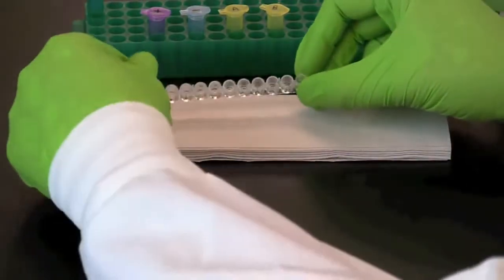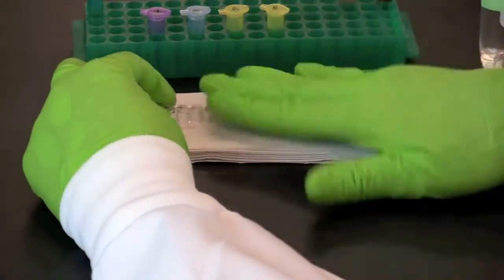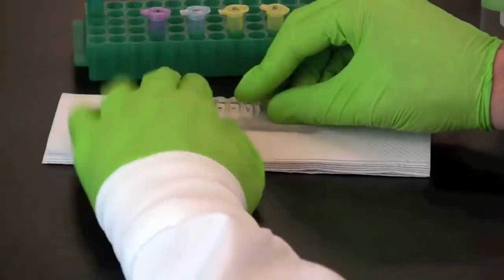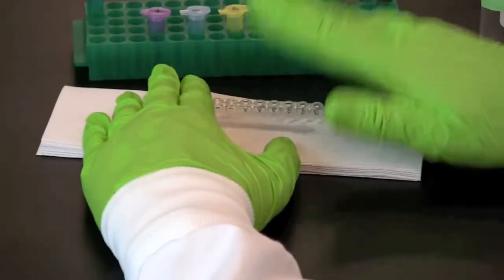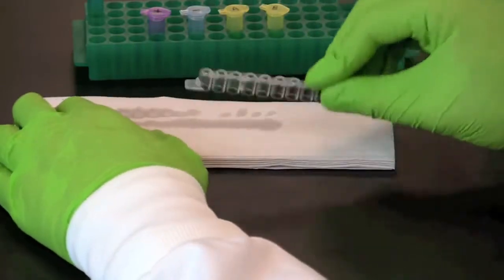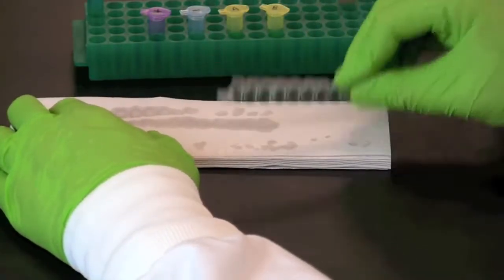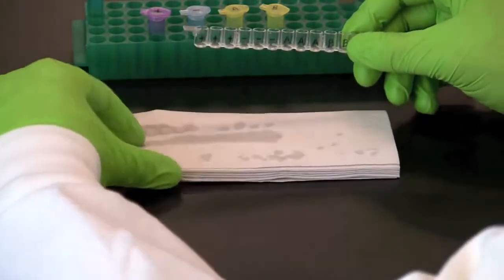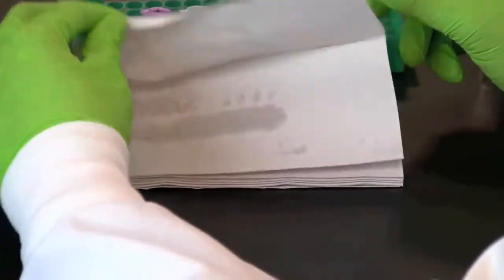Tip the microplate strip upside down onto a short stack of paper towels and gently tap the strip a few times. Make sure to avoid splashing sample back into the wells. Discard the wet paper towels.